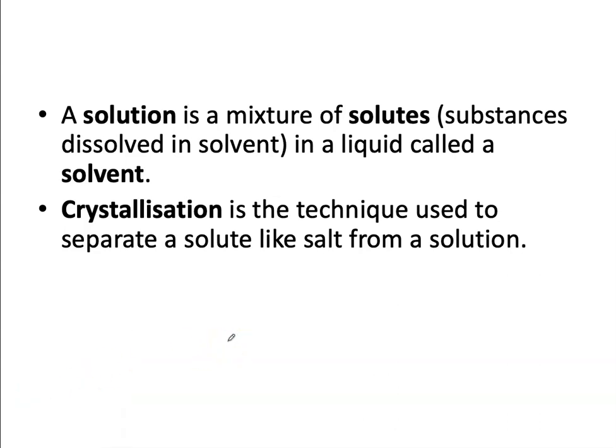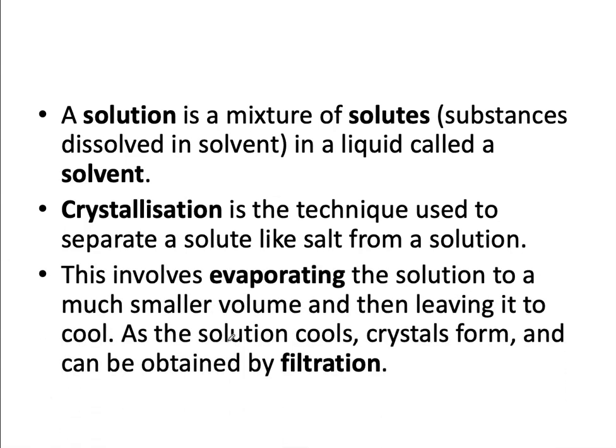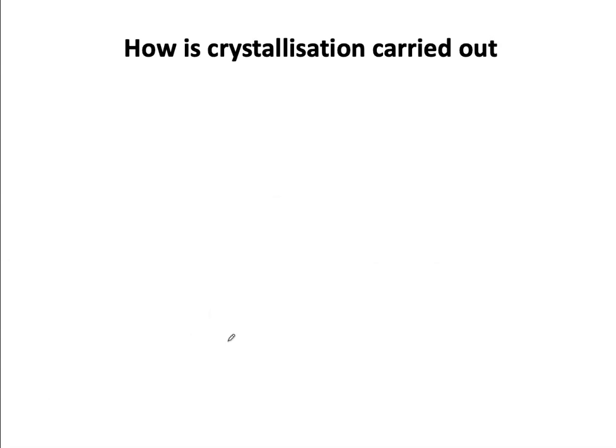Crystallization is the technique used to separate a solute like salt from a solution. In other words, to take out a solid that's dissolved in a solution. Crystallization involves evaporation, and it also involves filtration. Okay, so let's look at how crystallization is carried out.